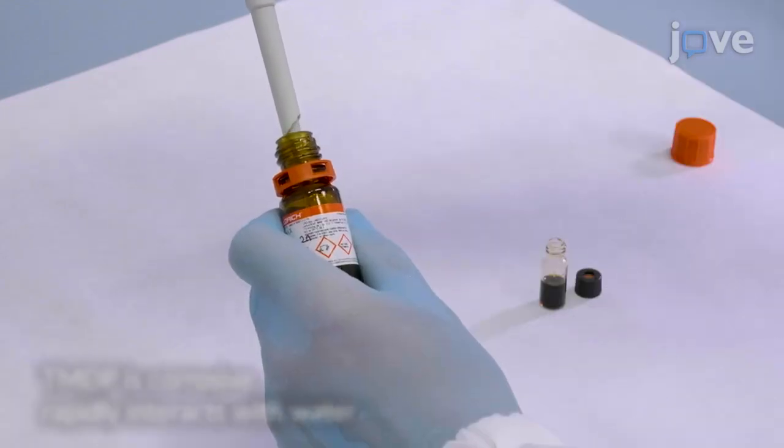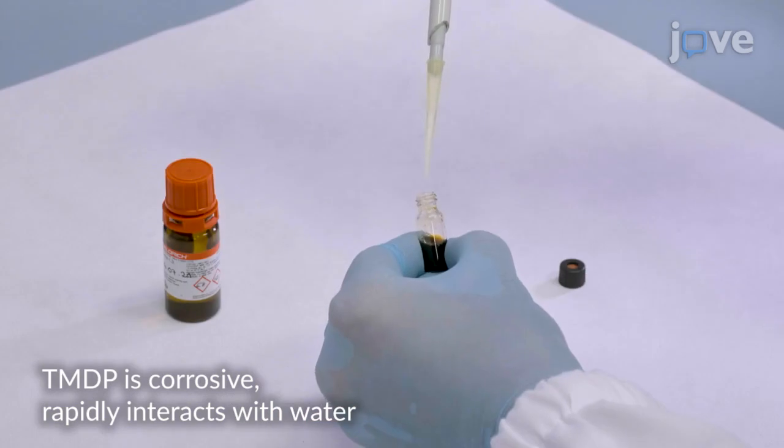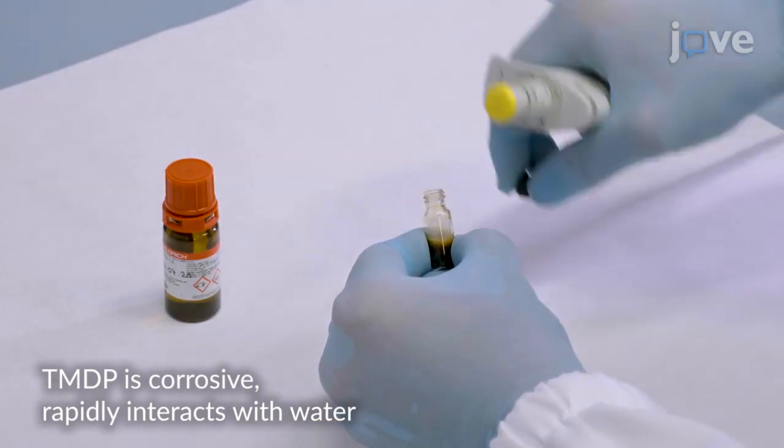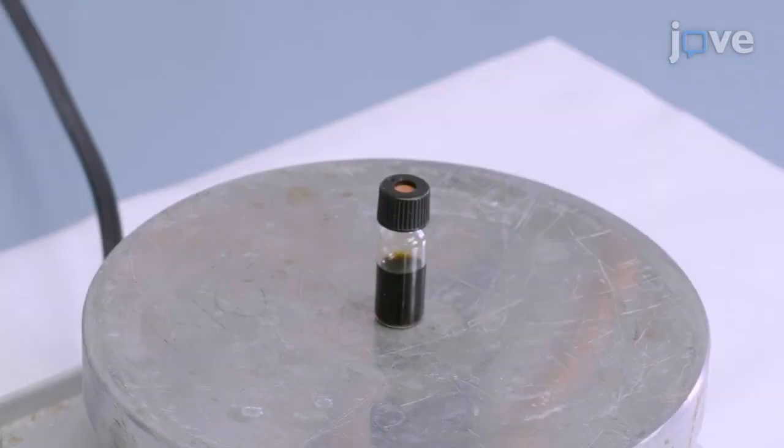When the sample is completely dissolved, transfer 100 uL of tetramethyl-dioxiphospholane (TMDP) to the sample solution while working under the hood. Seal the sample solution before placing it for vigorous magnetic stirring.